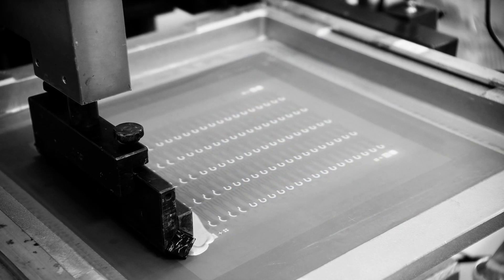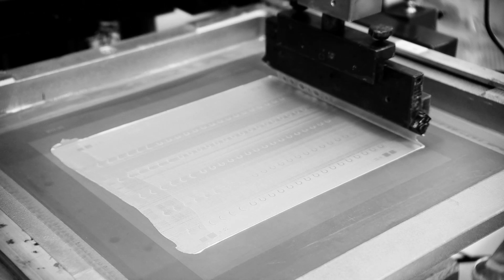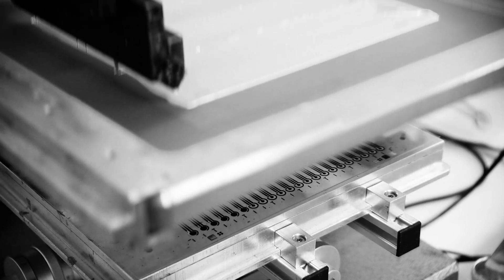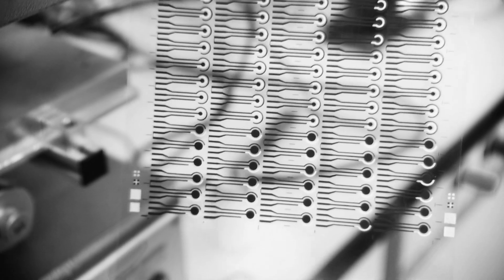CSCM offers state-of-the-art printing technologies and the additional advantage of a small lab that can develop printed electrodes. Our sensors are versatile in size, structure and electrochemical functionality, ranging from thin-film electrodes to thick-film 3D structures.